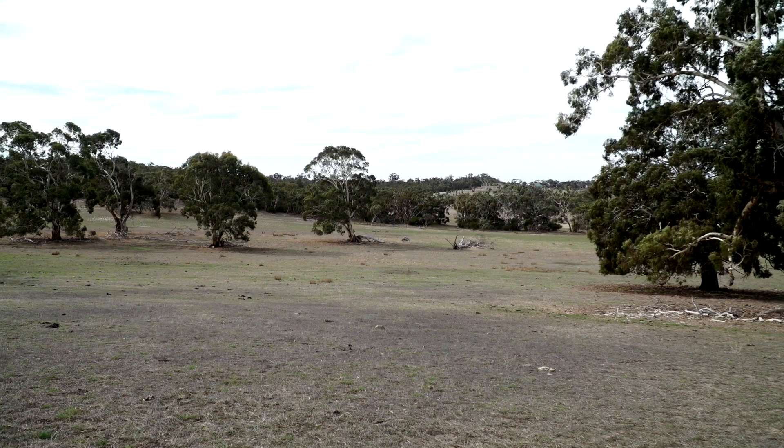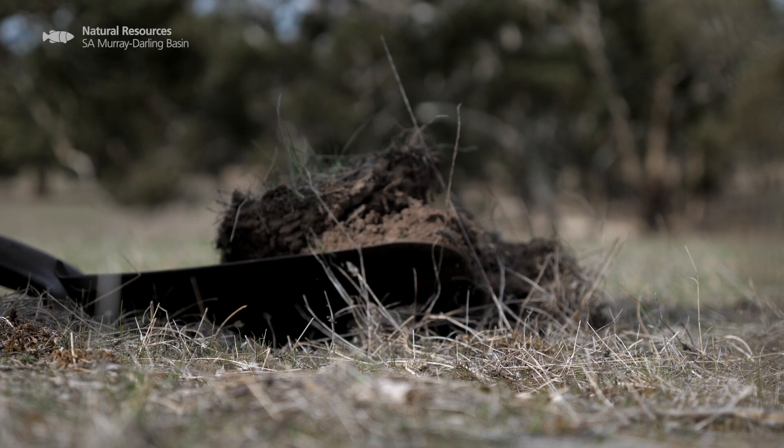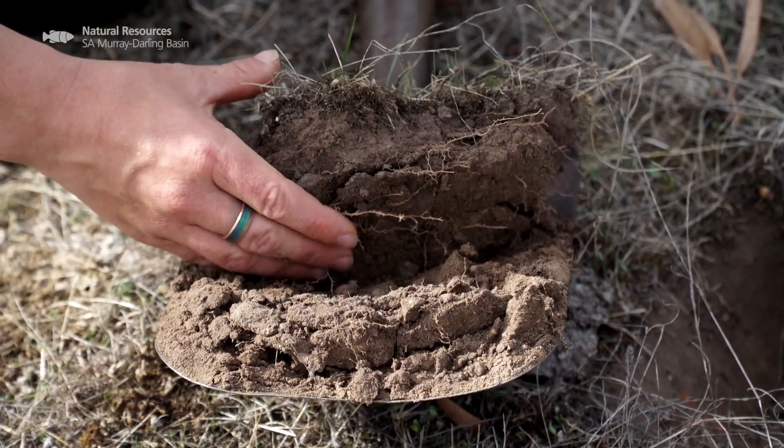Hi, I'm here today to look at the soil pH of this paddock. Understanding your soil pH is actually really important. It's what dictates what nutrients are available to your plants, whether that's your crop or your pasture. And it also dictates what toxic elements are going to be available for your plants to uptake.